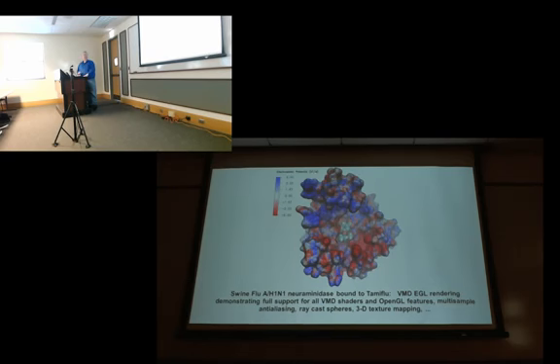So if you have things you want to calculate in parallel, or you have an analysis where you want to produce images as some work is being done in a simulation or otherwise, VMD can produce the same images in an off-screen buffer without a GUI and without any window or any of that, using features like EGL as it can using the conventional version. And we have an EGL version of VMD available for Linux on the website now that you can use. And it does all the normal stuff. You can draw text labels and things like this and color things like by electrostatic potential and so on.